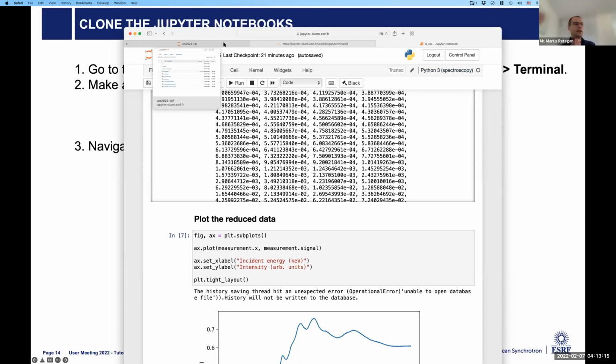So the issue is how you can import that data, from various sources, into a library like this one. One way to solve this problem, since I wrote the analysis part of the library, is for you to send me, if you're willing, a file that you want to process, and then I can adapt the library so that it can process that type of file.